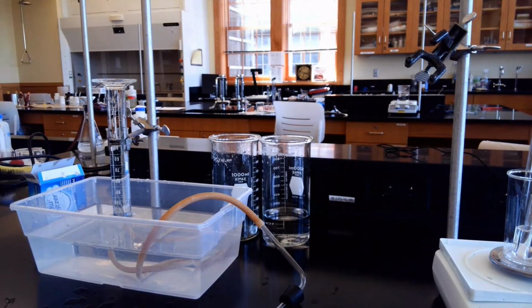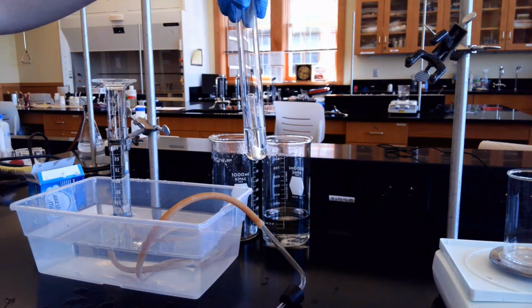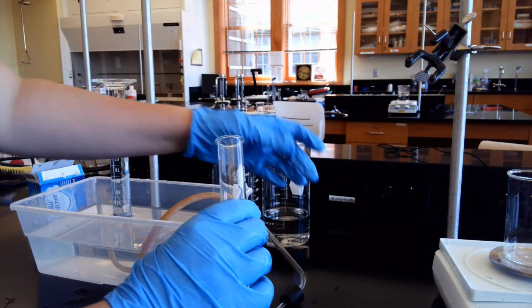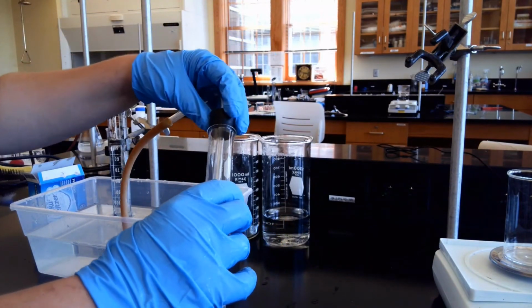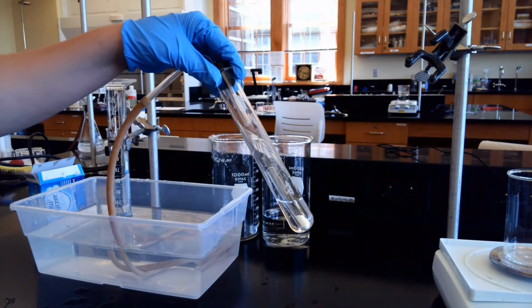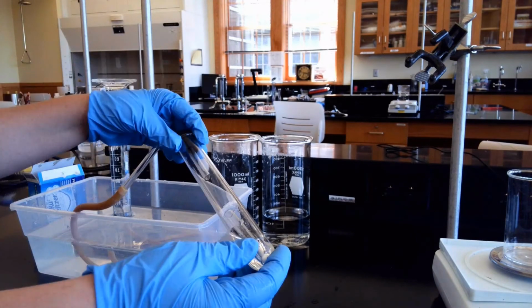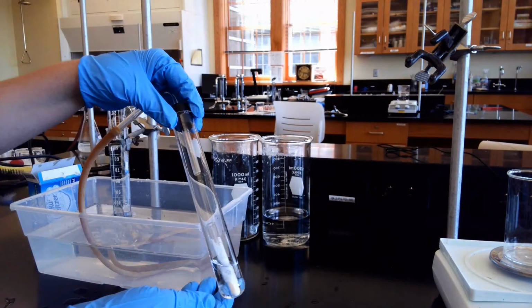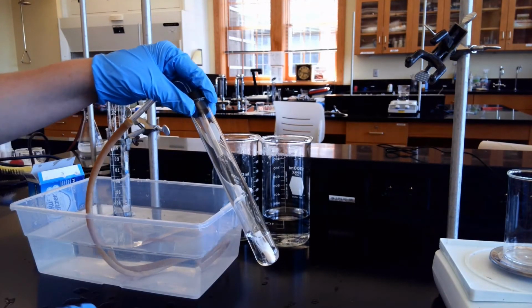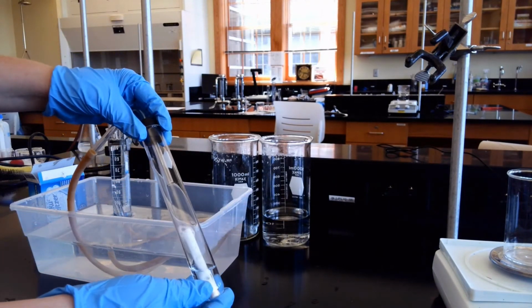So now that we are good to go, the next step is taking our gas generator from over here. We are going to attach the top, make sure it's a snug fit. Okay, so we're good to go now. We're going to agitate this, and then you should see the bubbles come in. So here we go. Look at that. And I'll try to get out of the way. We're going to mix, mix.